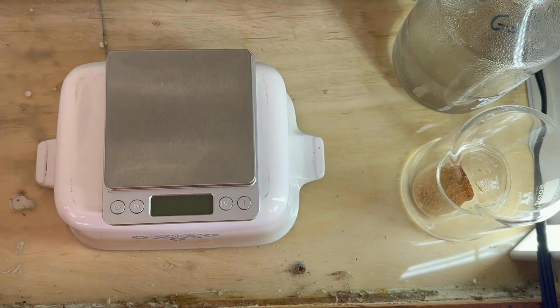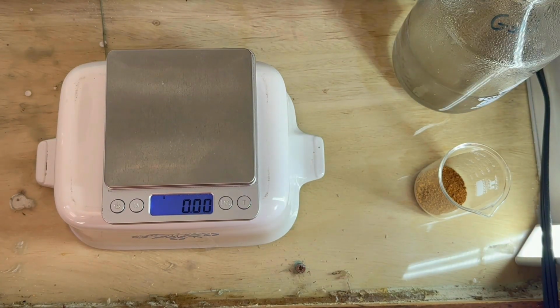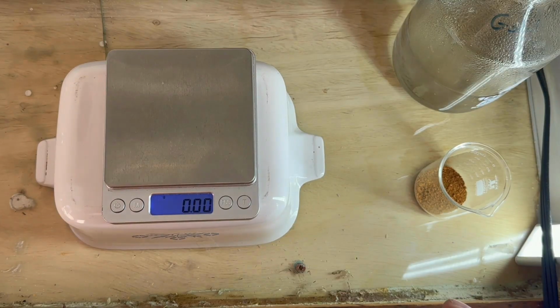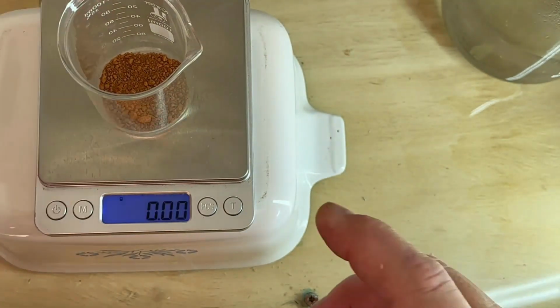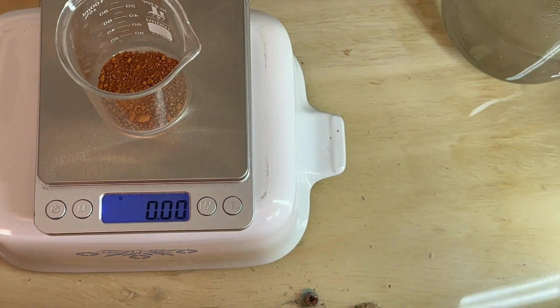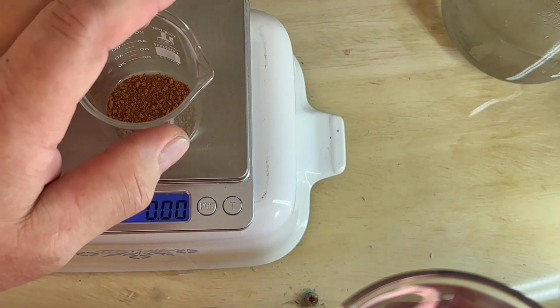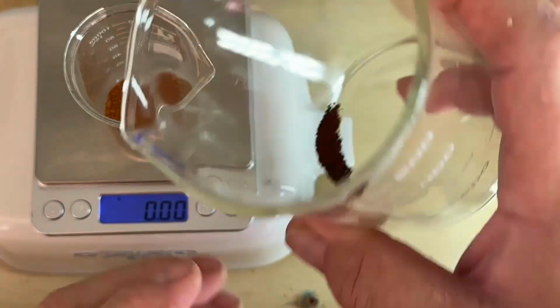So take our scale, go ahead and get it on there, and what we're going to do is use the beaker. This is from our previous video of waste solutions. It's about 7.33 grams in this beaker. Go ahead and set that up on the scale, tare it out. We'll then add our current powder to this and refine it all together for a final refine once we're through the process. So here we go.